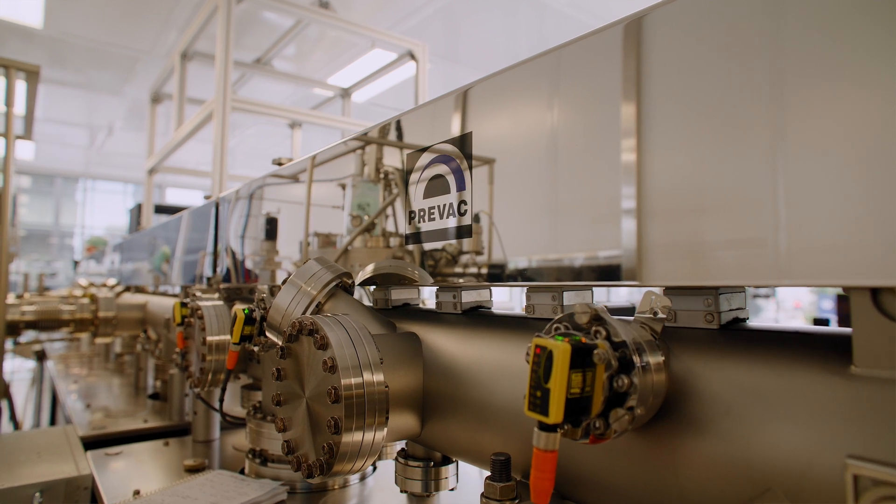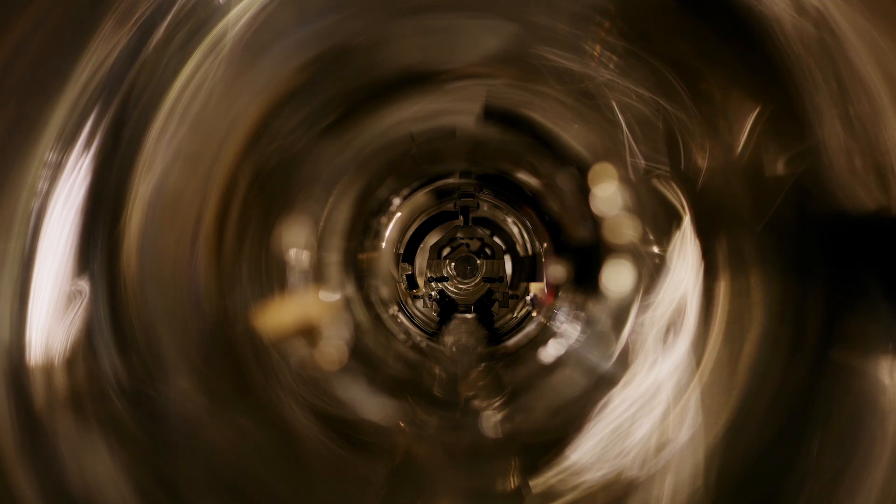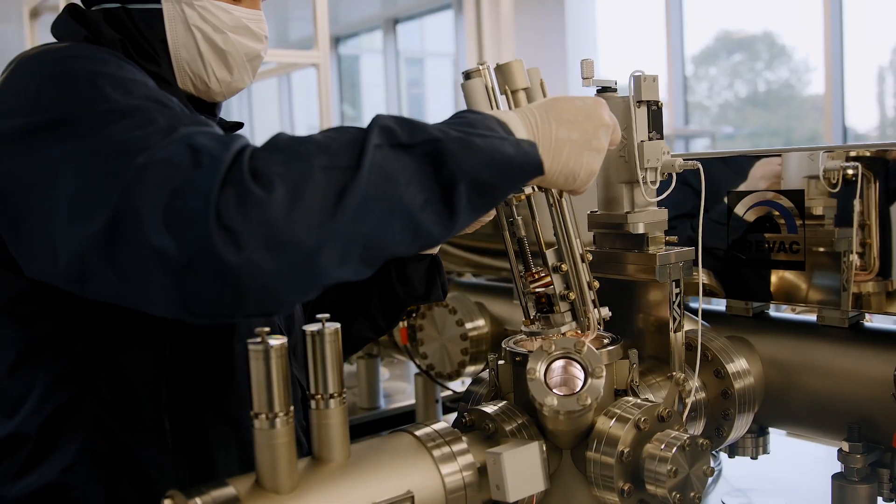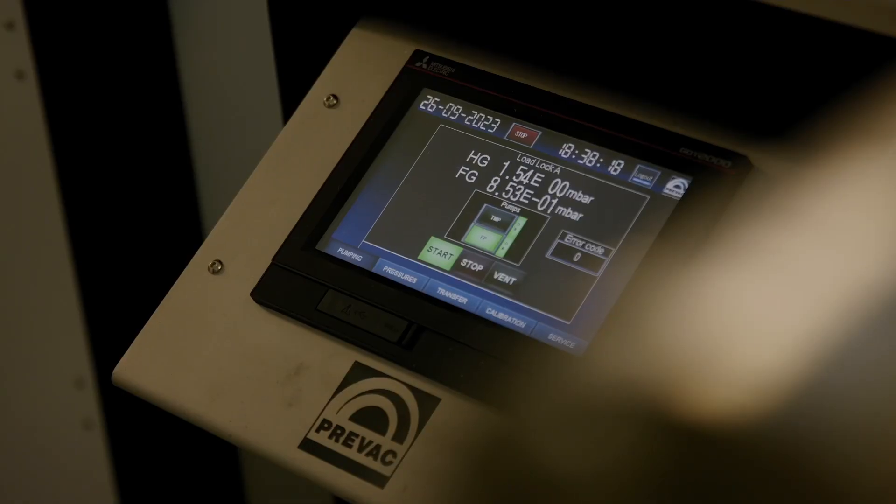The backbone of the system is the transfer tunnel, a long vacuum chamber that allows us to move samples around the system. At one end we have a load lock system to load samples in and pump them down into the ultra-high vacuum environment.